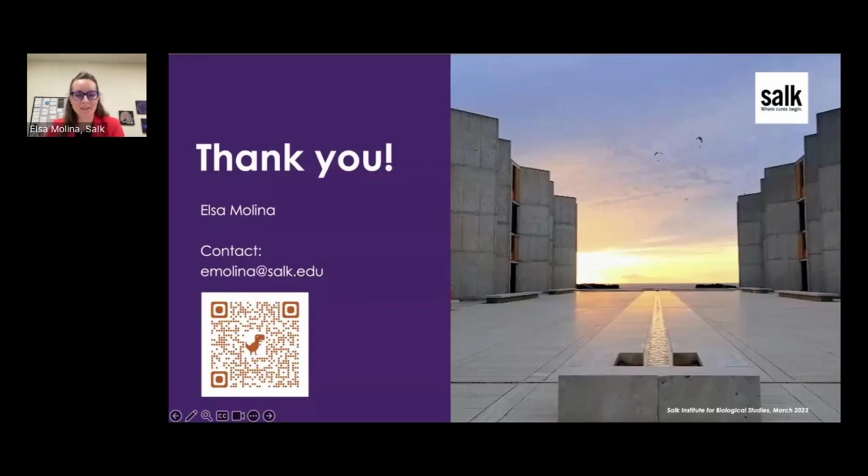Yeah, thank you very much, Heather. This is a great question. This will depend on your research question. Do you need to understand the transcriptome or the proteome at a subcellular level, or do you need to understand that all over your tissue? So it really depends on the research question. Whole tissue spatial transcriptomics might be enough for some research questions, and sometimes you need a subcellular level.